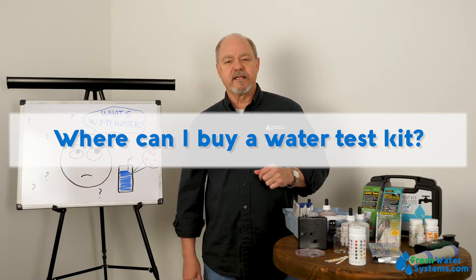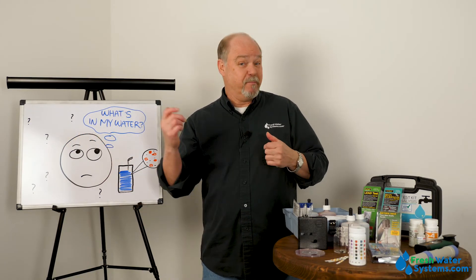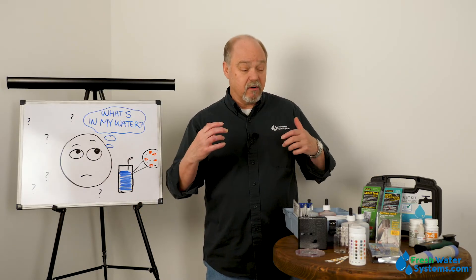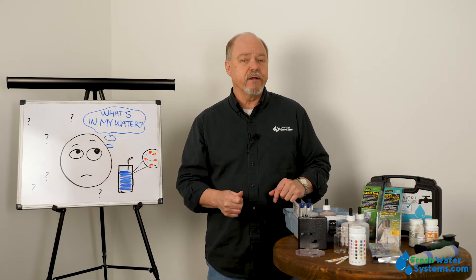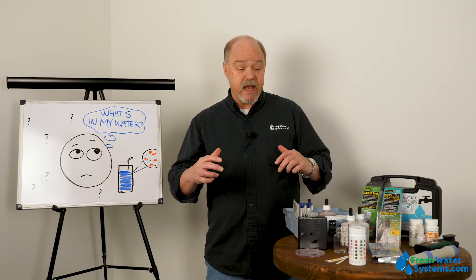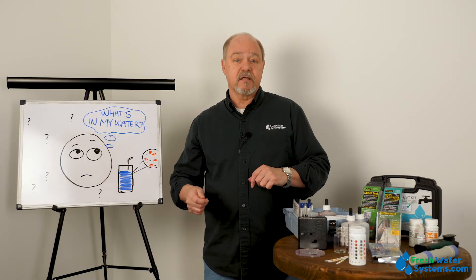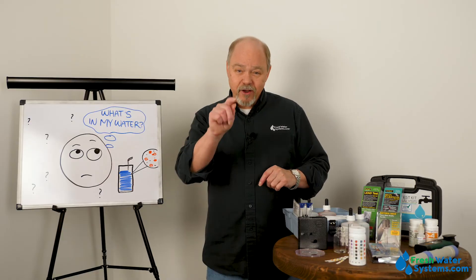Where can I buy one of these home test kits? Well, freshwatersystems.com is probably the best place to get your testing equipment, test strips, or products. Home test kits are really great handy tools for you to keep up on your water quality and to keep up on whether or not your water treatment equipment is working properly. It's also important for your own peace of mind to have the ability, whenever you want, to test your water and know that what's in that nice clear glass is not going to harm you.